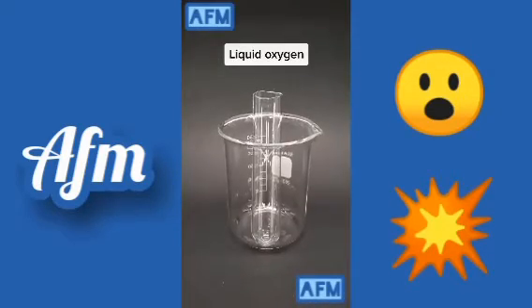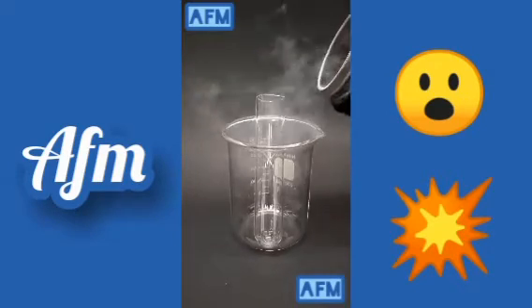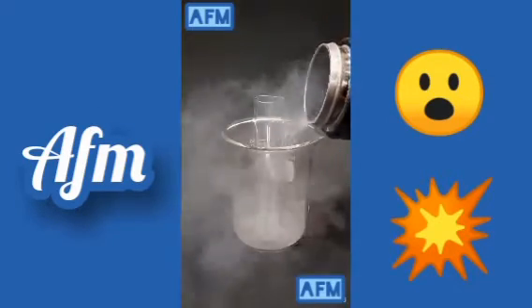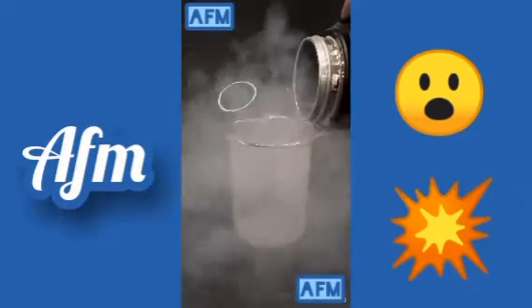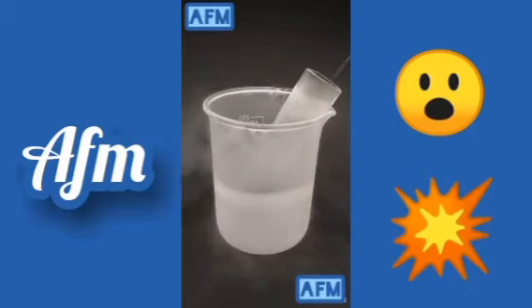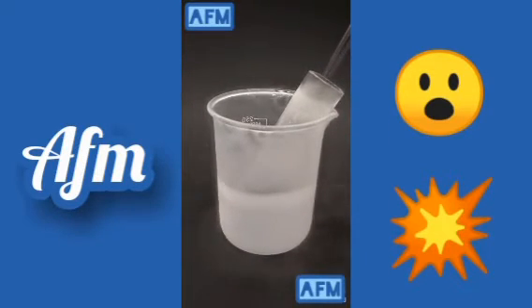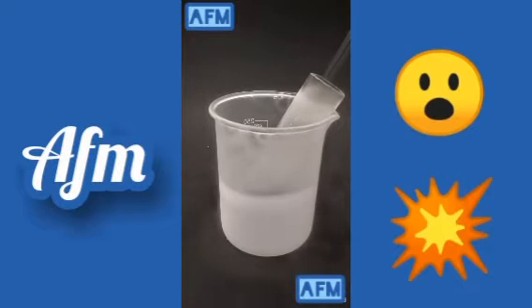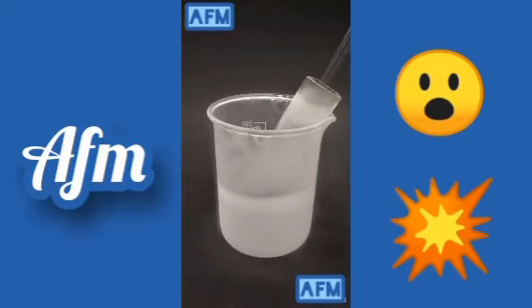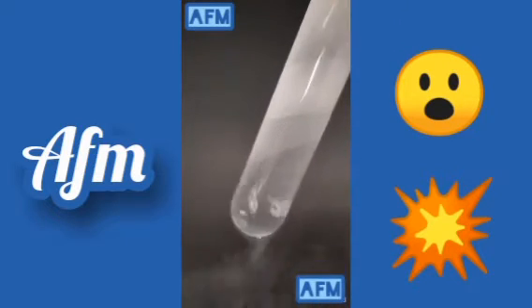So today, I'm going to be making some liquid oxygen. Oxygen's normally a gas, but it can be turned into a liquid using liquid nitrogen. When the tube's really cold, I can start to shoot in some oxygen gas. I can't really see what's going on here, but after a few minutes, there should be a decent amount of liquid oxygen. Okay, so by now, it's probably good, and I can take it out.